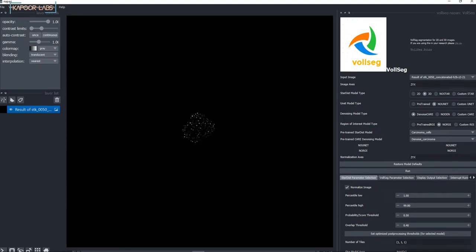And the thing about these cells is that during the early stages they hardly grow. It's also confocal, so 8-bit imaging, and there's a lot of zeros present in the background. And since there are a lot of zeros present in the background, it may cause issues in normalization of these images, which is an important step when you're applying these kinds of deep learning models.